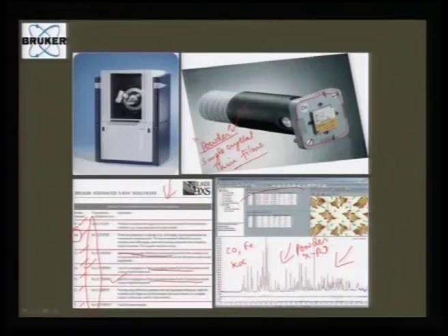So, the number of peaks can also give quantitative information about what sort of system you are working with, and there are several menu driven interactive softwares available, which can generate the atomic positions, give you the lattice parameter, lattice dimension, everything can be mapped. So, it is very fascinating to use an X-ray diffractometer principally to understand what is the system that you are working with.